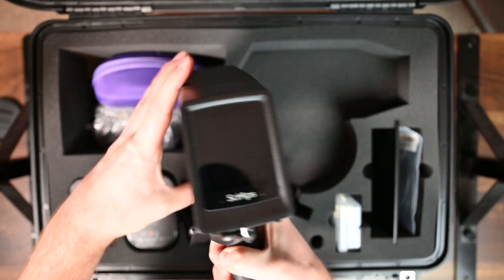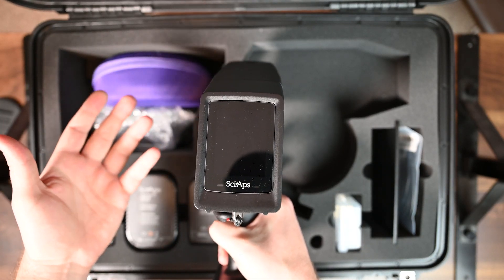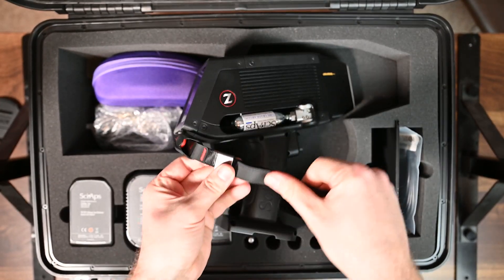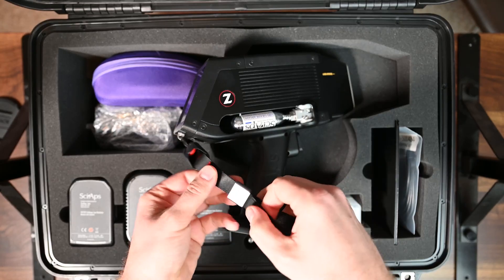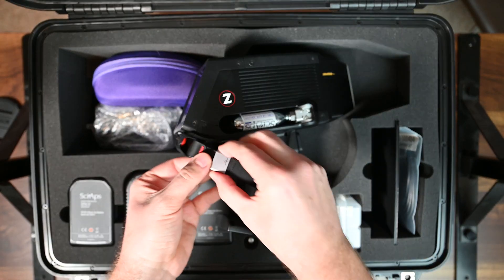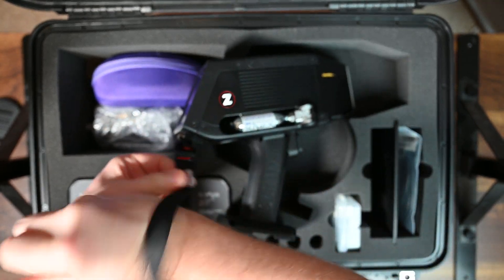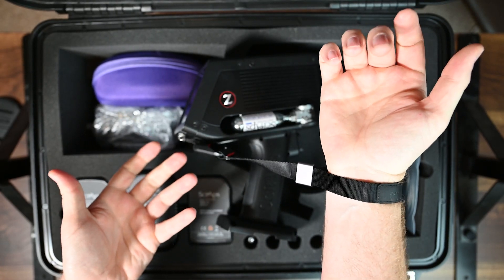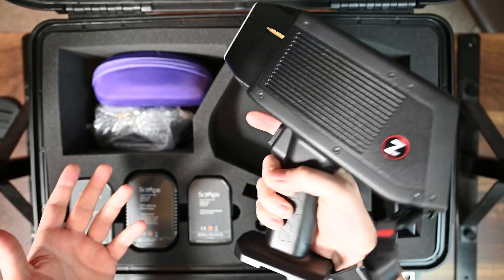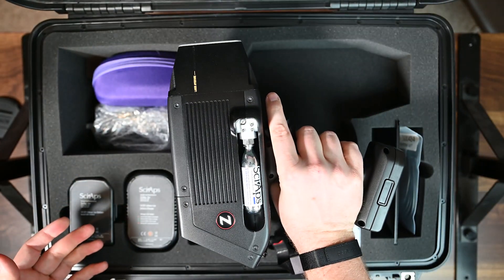The screen on the back is small but it's vibrant and responsive, so I actually like that a lot. They use this Peak Design wrist strap, which I use for a lot of my camera stuff as well. These are great because this little piece slides — it's a noose around your wrist — so if you put this on, it's not going to go anywhere. It gives you a little extra slack and it's comfortable to wear.